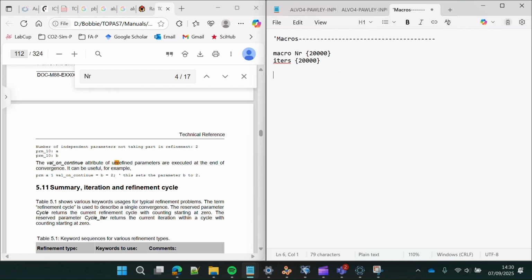And the next thing we're going to input is let's tell it it's a charge flipping run, and then we need to put a file. So let's say charge flip in.